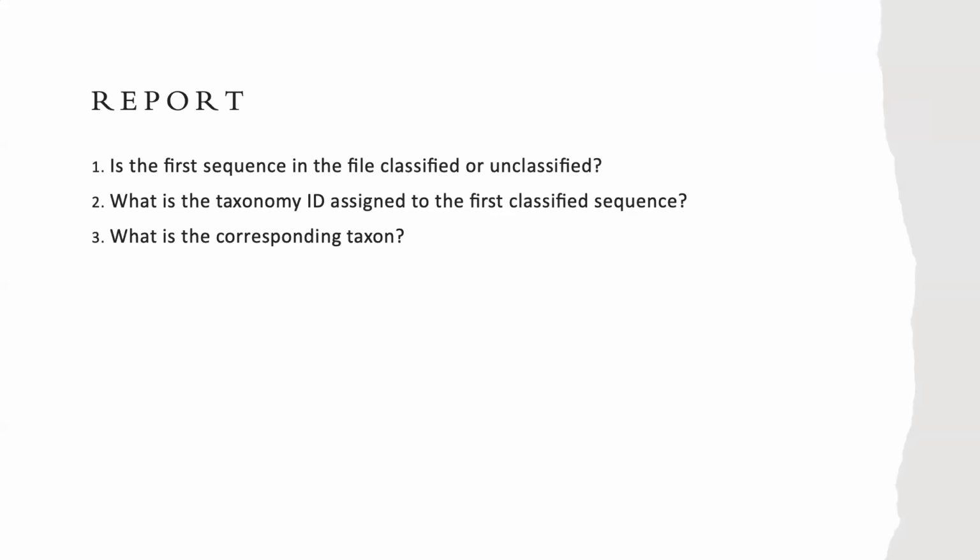Excuse me, sir. In the two outputs, one is the classification and another is the report only. You're looking at the report file? Yes, I need to look at the report file or the classification? The report file.